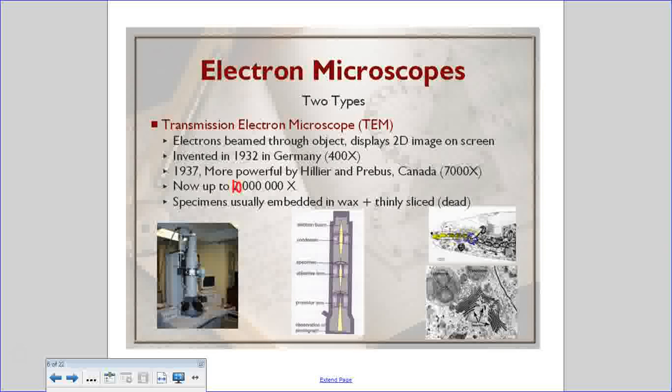So each of those is an E. coli. You can see them eating them. So it's pretty cool. This one is showing the inner parts, so the organelles that you'd find within a cell. Okay, so this is Golgi apparatus, looks like flattened pancakes. This is a lysosome. It's filled with things that it's breaking down right now.